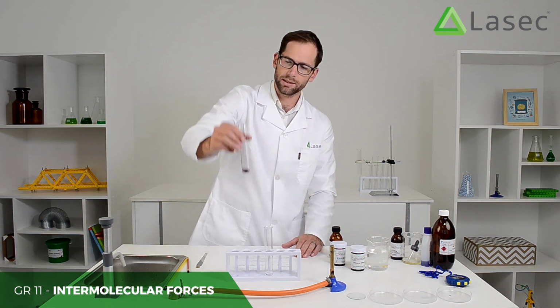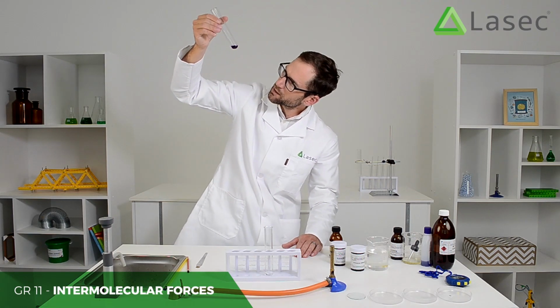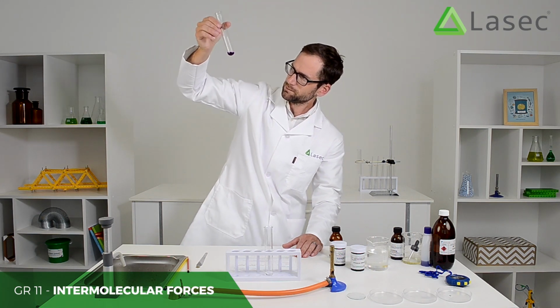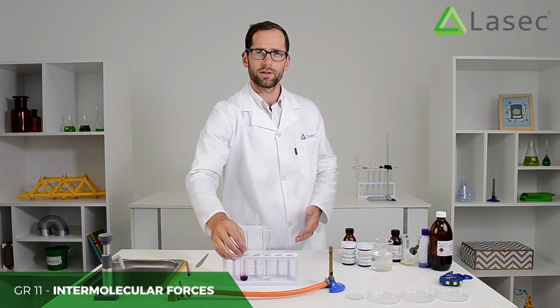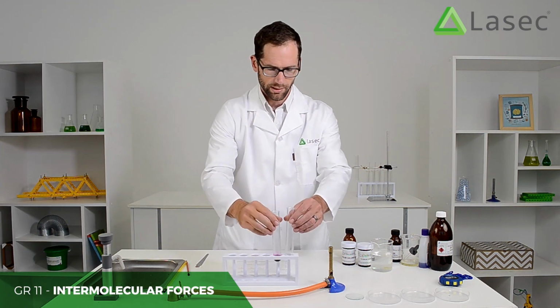With the potassium permanganate, I can pick it up here, I can look at the test tube, hold it up to the light. There's hardly any, just a tiny bit of crystals at the bottom, and it is mostly dissolved. Beautiful purple color. Right, now next the learners are going to look at dissolving these in ethanol. So we'll just move those to the side.